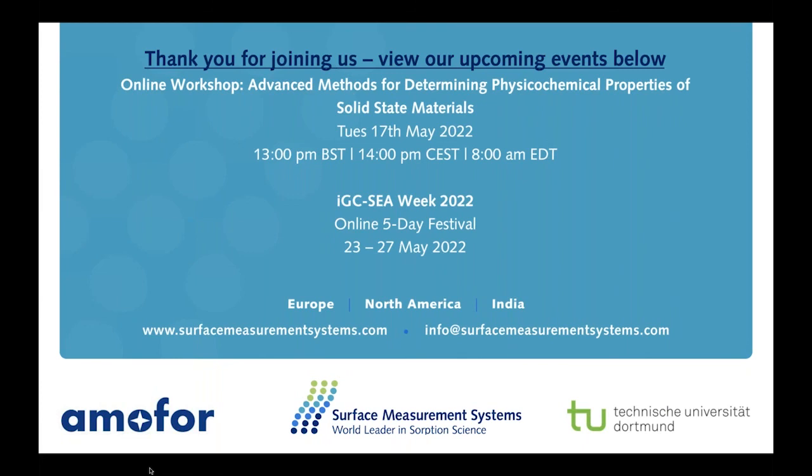So porous materials, particularly ones with extremely high surface areas, are quite challenging in IGC SEA. The problem with really high surface area materials is that they take really long times to elute our probe molecules. So elevating the temperature or decreasing the amount of sample that we're packing into our columns, in order to get complete elution data, will not only improve the data but also improve the trends that you're seeing.